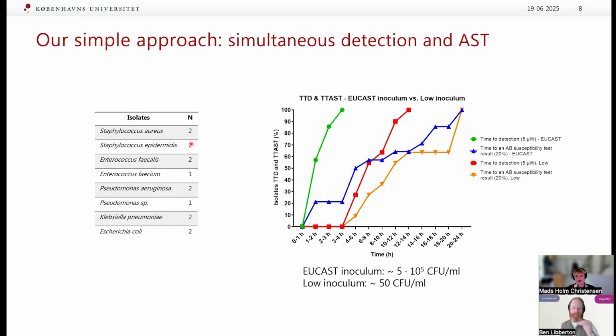So maybe even sooner, halfway through, we've detected all of the gram negatives, so we know it must be gram positive if it's up at this level. So you can start making slightly broader decisions, maybe not the exact antibiotic you need, but you could say, okay, we know it's a gram negative now, so then we'll treat it differently. Or we know it's in this cluster, so we would treat it with these instead. Do you have any idea of how that could be used practically?